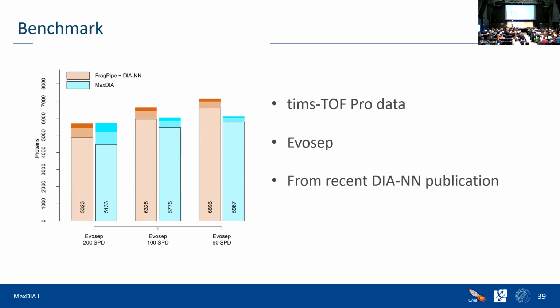Yeah. With the in silico library, there is one predicted retention time given, which might not be the correct one, because it is what we start with in every run, so it cannot be correct in every situation. But a very common kind of column is used for the predicted retention times, and based on that it would then do a nonlinear recalibration of the retention time.